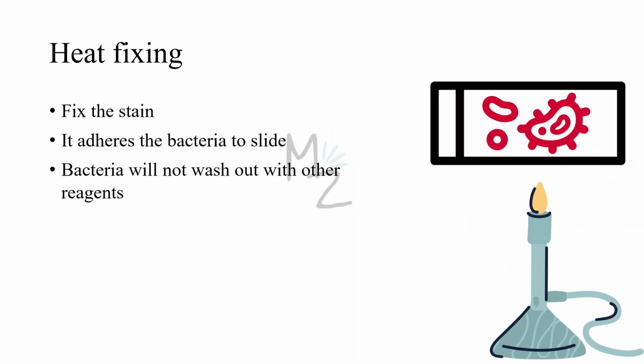After addition of the carbolfuchsin, we'll take the slide and we'll heat it up. That will fix the stain. This helps the bacteria to stick to the slide and bacteria will not wash out with other reagents.